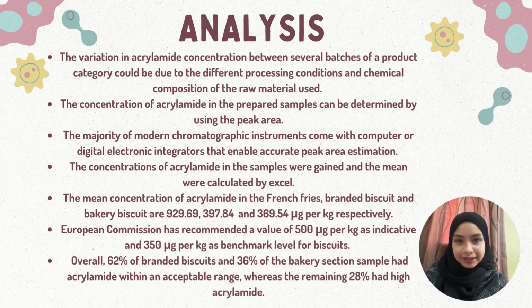Therefore, in the article, the concentration of acrylamide in the samples was gained, and the mean was calculated by using Excel. The mean concentration of acrylamide in the French fries, branded biscuit, and bakery biscuits are 929, 397, and 369 microgram per kilogram respectively.